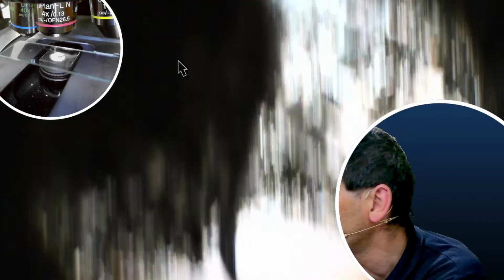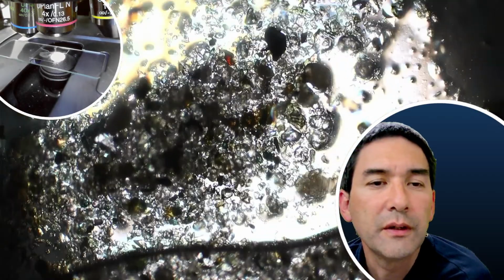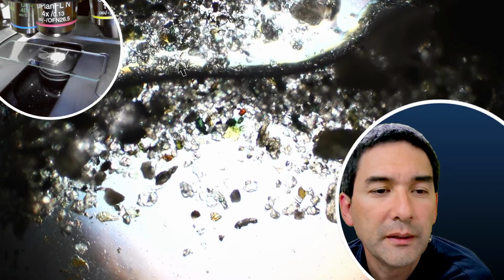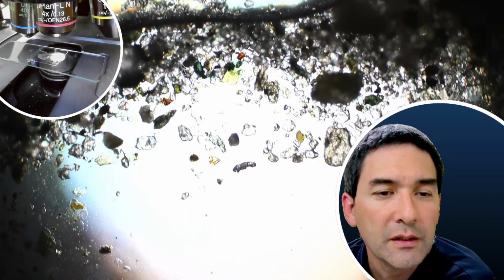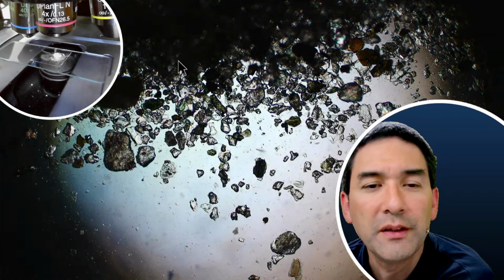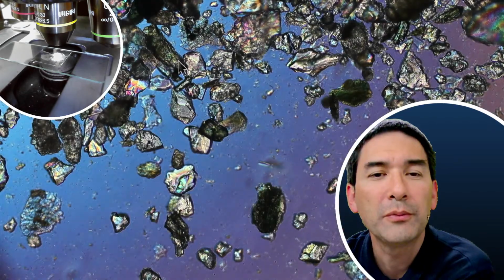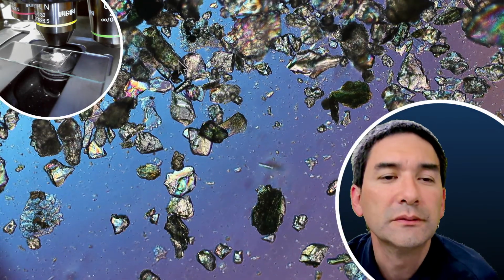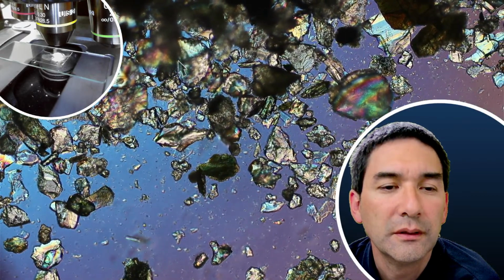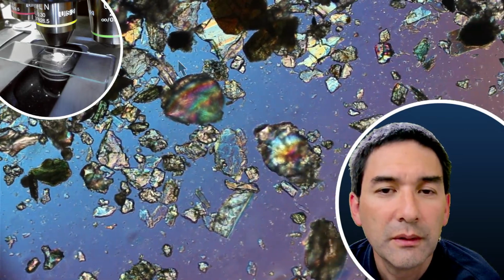So where do we see that? It is a little bit too dry here. It's probably a sample that is better suited for stereo microscopy than for the compound microscope here, but that's better. It looks quite nice, I think.